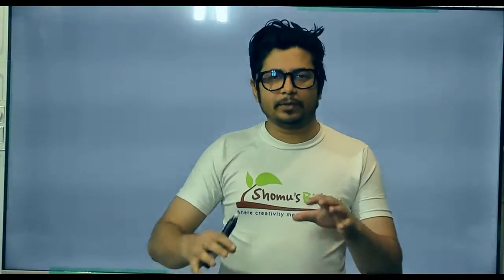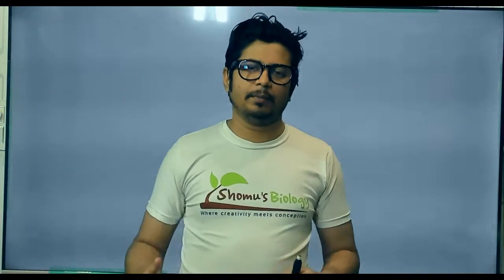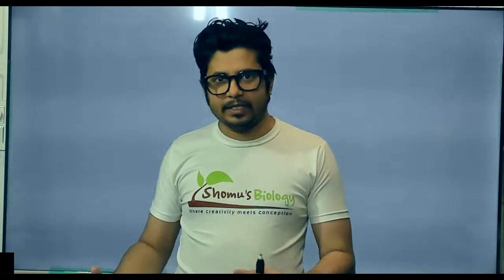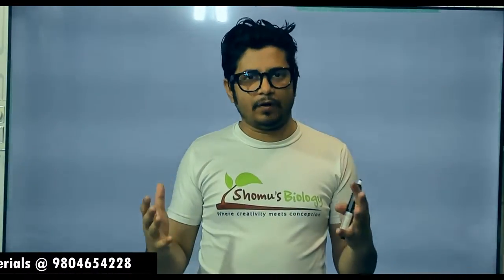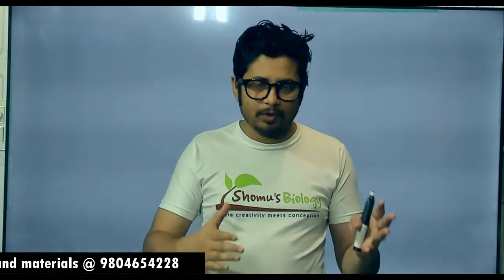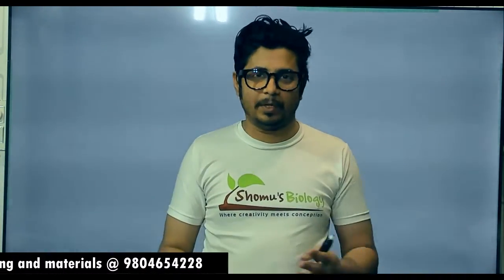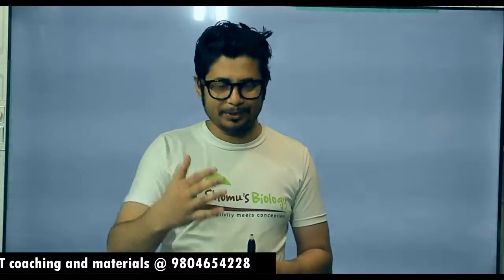In this video lecture, we are going to talk about gel electrophoresis. And in this series of lectures, the first lecture is all about agarose gel electrophoresis. We'll first talk about the basic principle of gel electrophoresis. Then we'll talk about agarose gel electrophoresis that utilizes the agarose gel to separate a mixture of DNA fragments, okay? And we'll also talk about SDS-PAGE, pulse field gel electrophoresis, and capillary gel electrophoresis in this series of videos, okay? So continue to watch them.